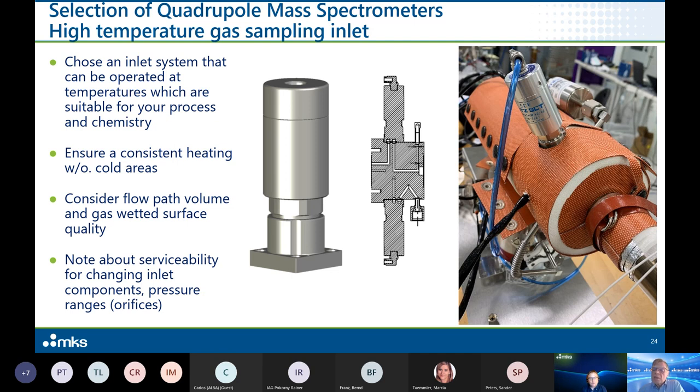Then we have another question, this time from Tao. Hi Uwe, thanks for sharing. I have communicated with you about bulk gas application to detect about 1 ppb impurities. Just wanted to follow up with you if you have new technology to do this application. Yes, welcome again. For that I would refer to another talk about atmospheric gas analysis, which you can also find on our network, where I have covered some specific aspects on bulk gas monitoring and trace detection for bulk gases. So maybe we can have some side communication about that.